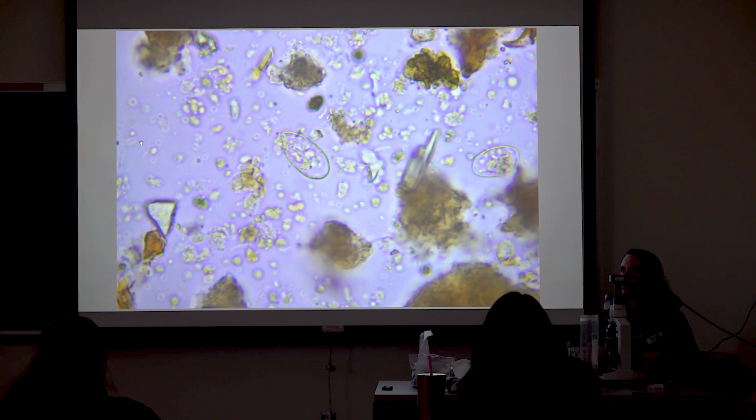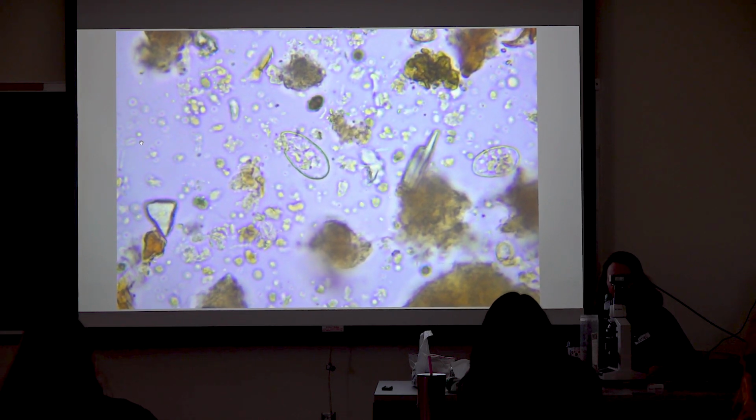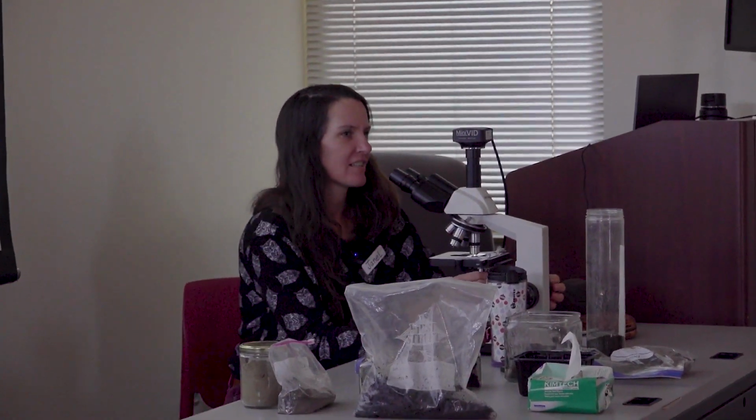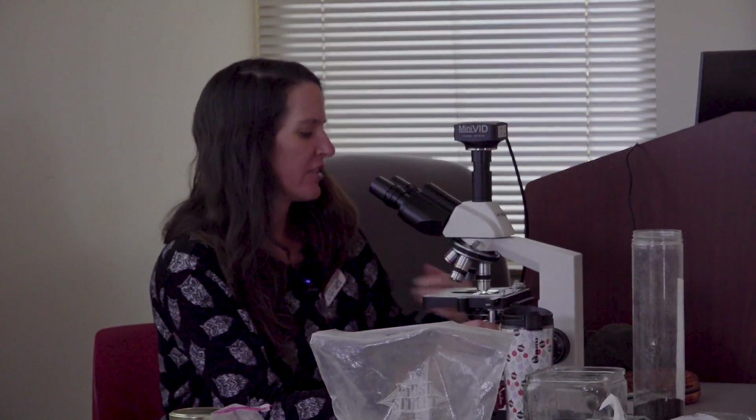So amoebas are a super good sign in your compost. They are predators, which means that you've achieved a nice high population of bacteria. So something else you're going to look for is diversity, right? So you have a lot of amoeba. Do you have a lot of different kinds of amoeba? Because a lot of them are going to have preferences as to what kind of other organisms they eat. Having diversity is important because it turns out a lot of microbes are really picky about what they eat.